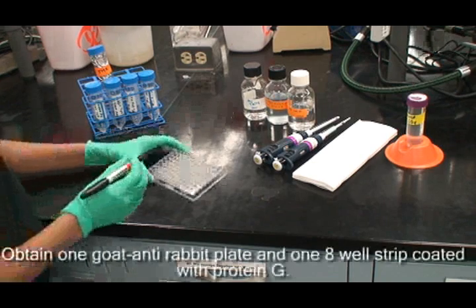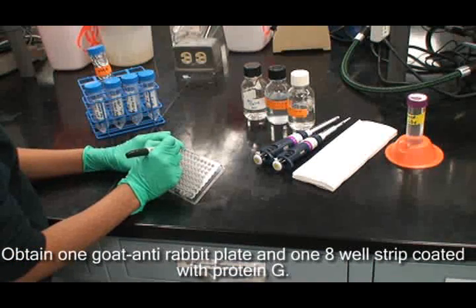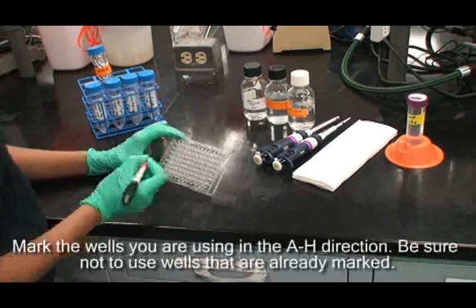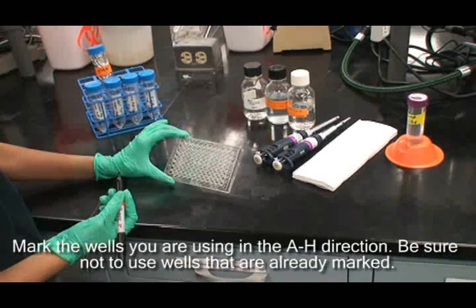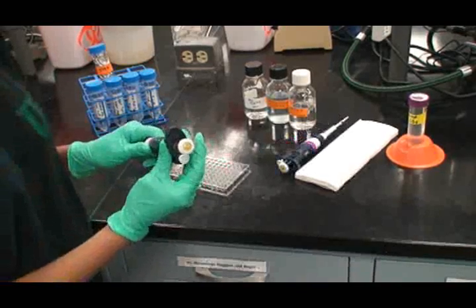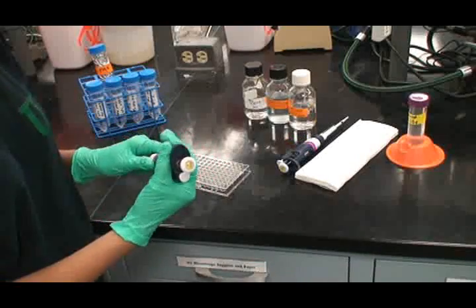Obtain one goat anti-rabbit plate and one 8-well strip coated with protein G. Mark the wells that you will be using in the A-H direction. Be sure not to use wells that are already marked.